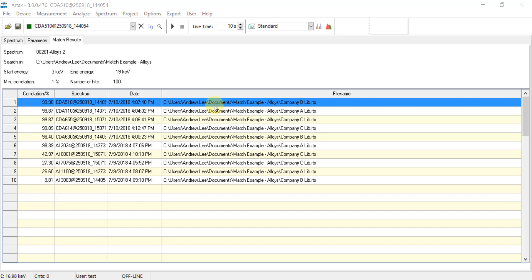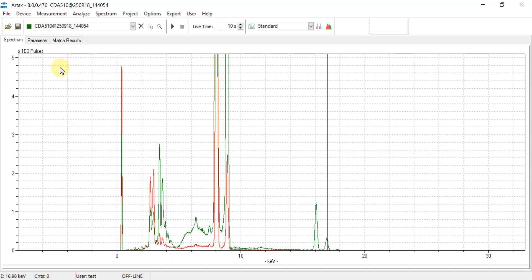Each set of samples may have a different range of correlation values. Alloys tend to have higher values that fall within a narrower range. In addition, by double-clicking on any one of these matches, the spectrum viewing window will automatically overlay that sample with the match so that a visual comparison can be made.